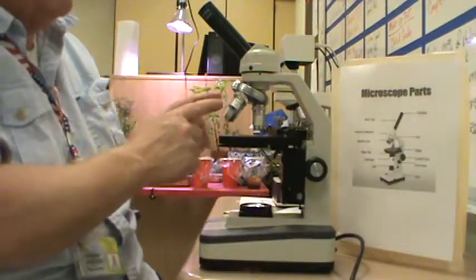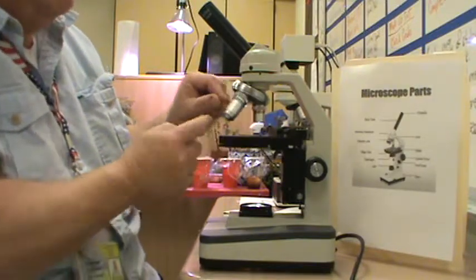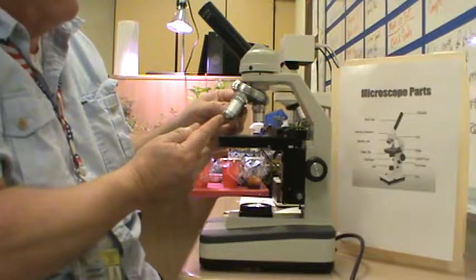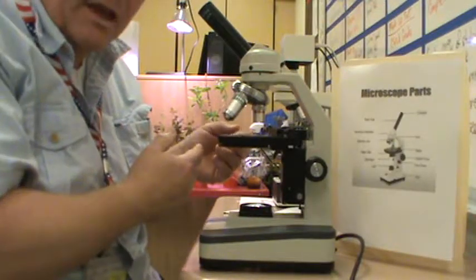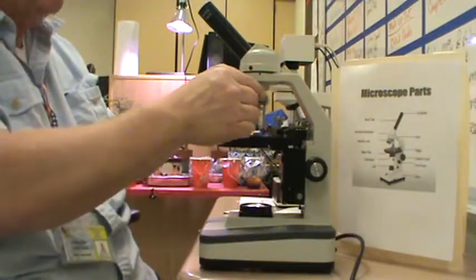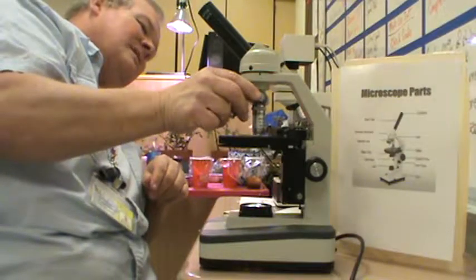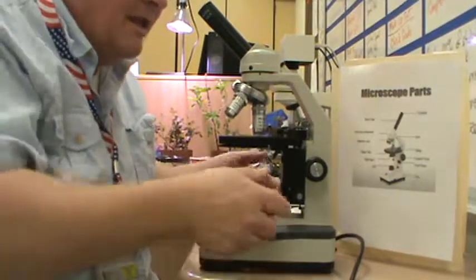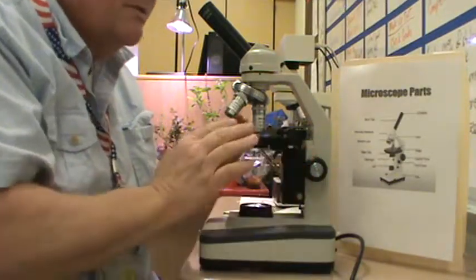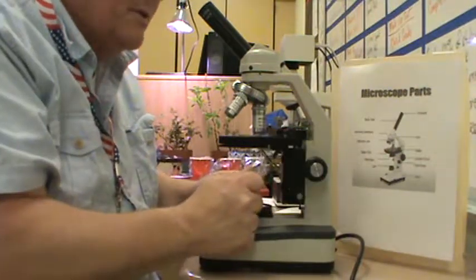Now, when we're rotating to the high power, very important. This high power, most of these are spring-loaded in the bottom down here. That's so that you don't break the slide. What I would recommend is step away from your microscope, rotate this, and see if it's actually going to hit the slide. If it appears it's going to hit the slide, rotate your stage down so that this will pop into place, and then gently bring this back into focus.